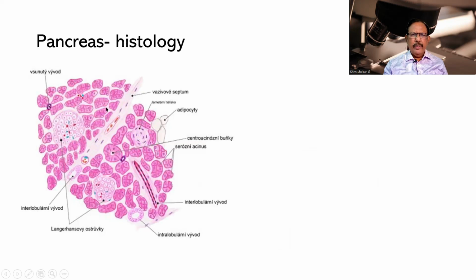See what is happening over here. At this magnification and sections, I will not be able to see all the things. They will be cut here and there. These are all the groups of pancreatic acini, and they are supported by loose connective tissue. This is slightly different, large, rounded, paler, and these are the groups of islet cells. And here I am able to make out some kind of a septum. Because always the septa are important, they will be carrying the blood vessels.